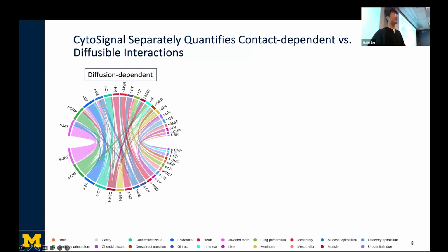I don't think CytoSignal is compatible with the 2 micrometer resolution, because we're not making any assumptions about intracellular communication, which means communication going on within each individual cell. That's another topic. But for 8 micrometer and 16 micrometer, it should be similar to the other single cell level spatial data we use.